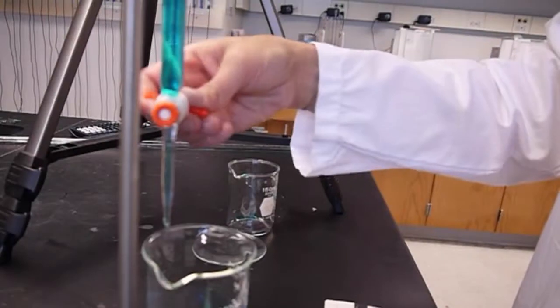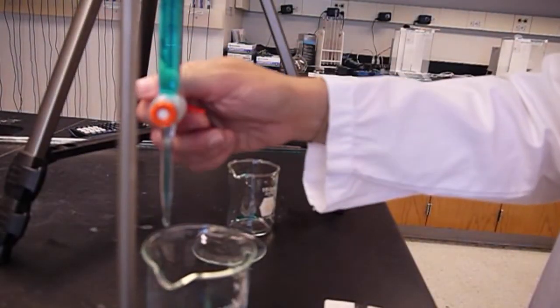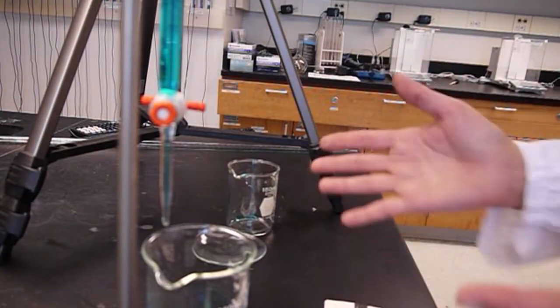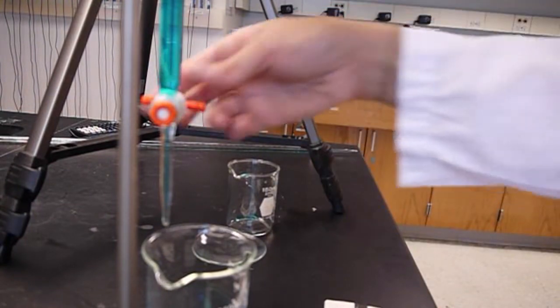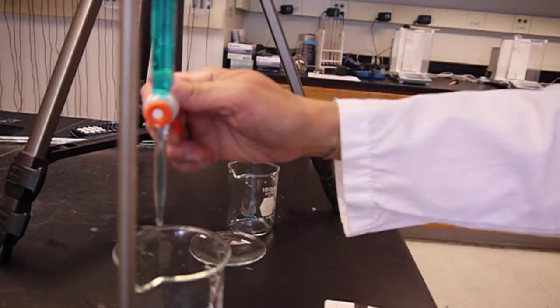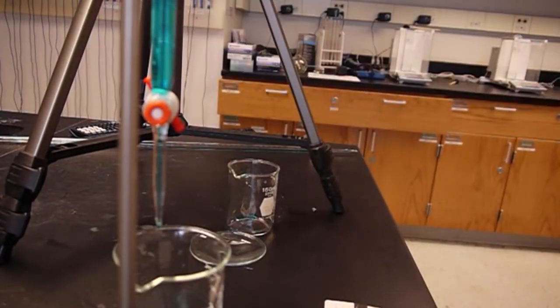So then if you're using a burette for a titration, you're going to open the stopcock, let some solution add into your beaker. That's pretty simple. You can fully open the stopcock, but you can also pull that back a little so that you're just going dropwise and just let that go.